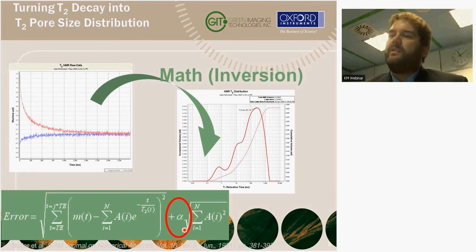What we want to do is introduce a term that allows us to use dependencies on that exponential signal lifetime. So one thing to say is if we have a pore size that's 1 micron, it's very likely that we'll have at least some pores that are 1.1 micron, right? So we don't just have an impulse response of 1 micron pores.